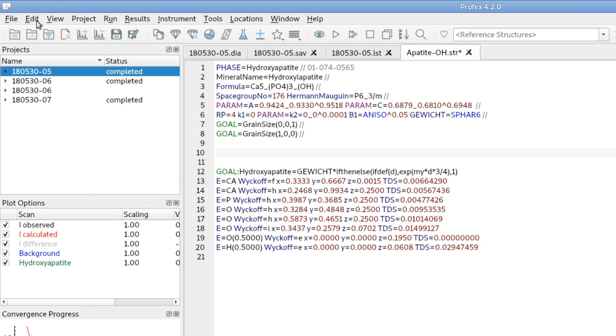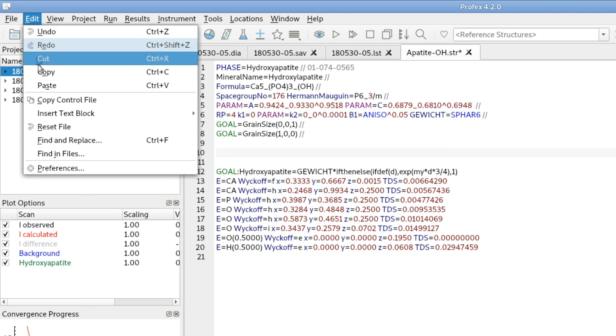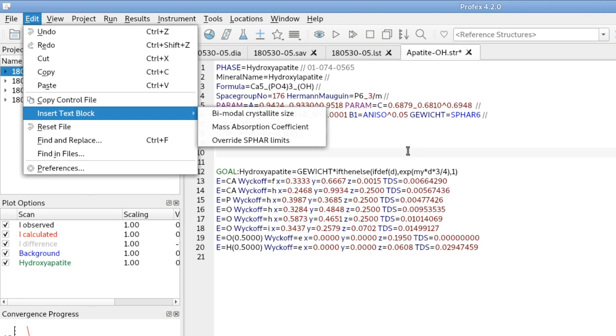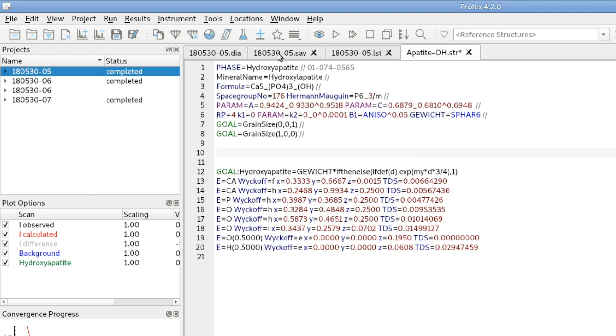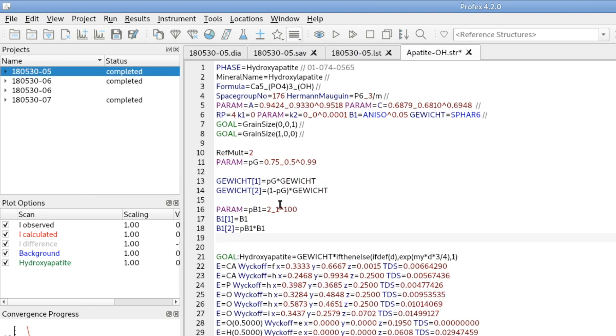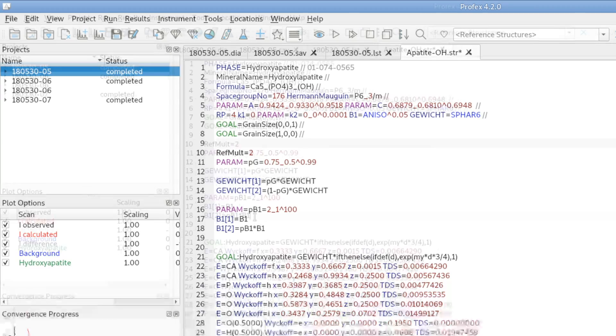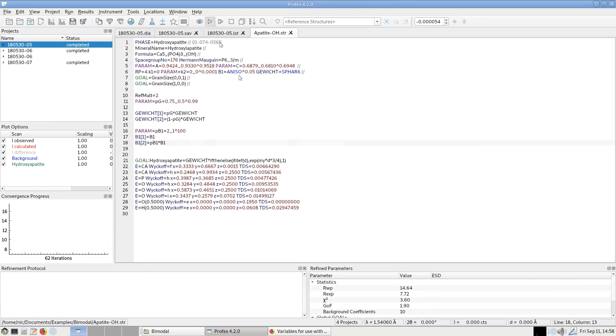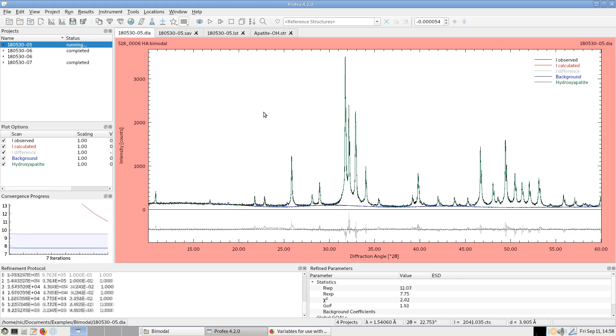And somewhere in this file we can add the text block and we find it in the edit menu, insert text block. And there is one called bimodal crystallite size. Or we also find the same text blocks here with the menu that looks like a text block. And we just add bimodal crystallite size and it will insert a few lines in the structure file. And now we can just repeat the refinement.